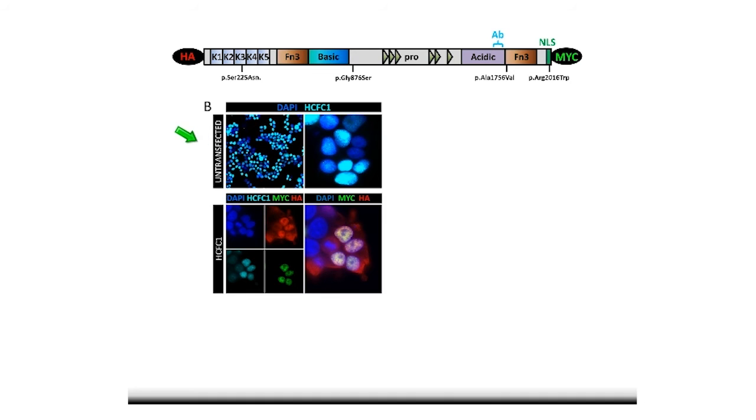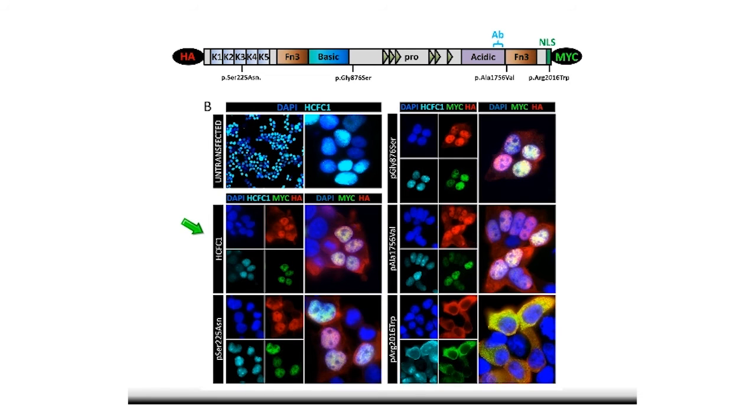It's in the nucleus. When we overexpress wild-type HCFC1, we can see that the MYC and the HA fluorescence overlaps in the nucleus, again overlapping with the endogenous expression. And when we overexpress the variants, we essentially saw exactly the same features, except for the nuclear localization variant. You can see quite clearly here that both the N-terminal tag and C-terminal tag are predominantly, not completely, but predominantly excluded from the nucleus. So certainly, this was telling us that we have a different sort of variant here. As opposed to our initial discovery of a non-coding variant which caused overexpression, these particular variants look like they were loss of function.